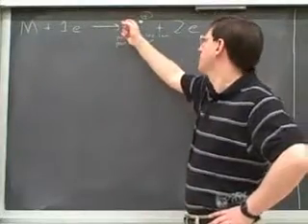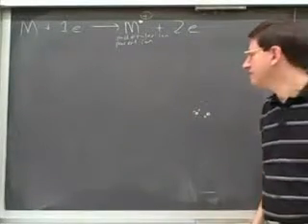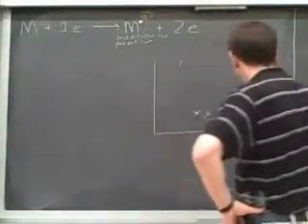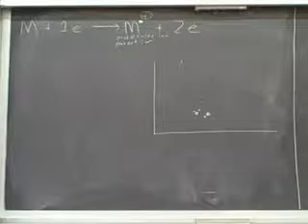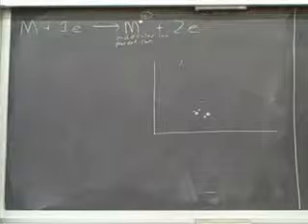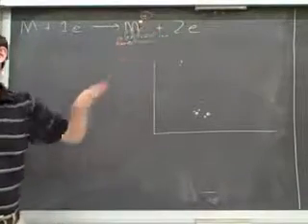Then we allow this molecular ion to go into the detection apparatus, and it will be detected. We're not going to go into the details, but the apparatus uses a magnetic field to detect the properties of what's going through the apparatus. Have you guys taken any physics? Yeah? I don't know if you remember from physics, the magnetic force only affects charged particles.